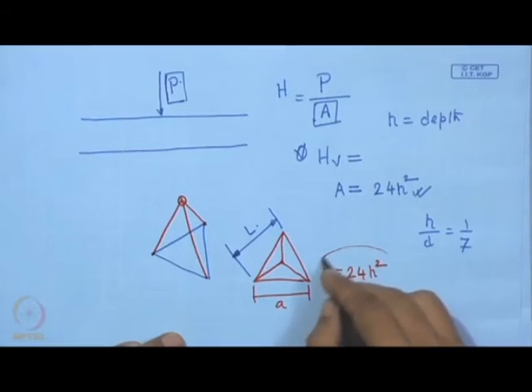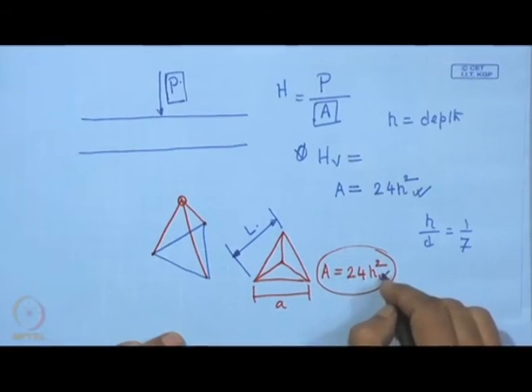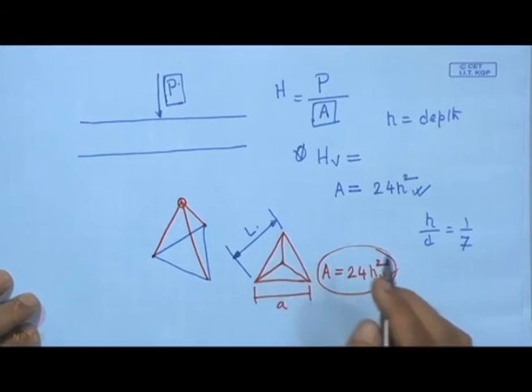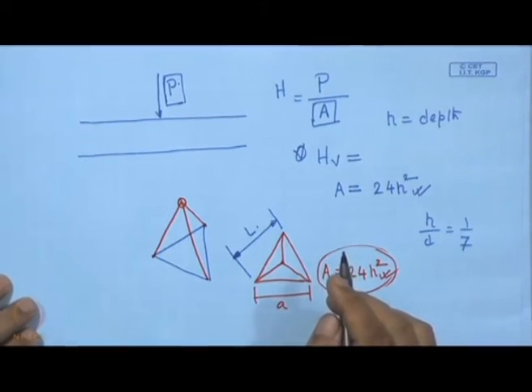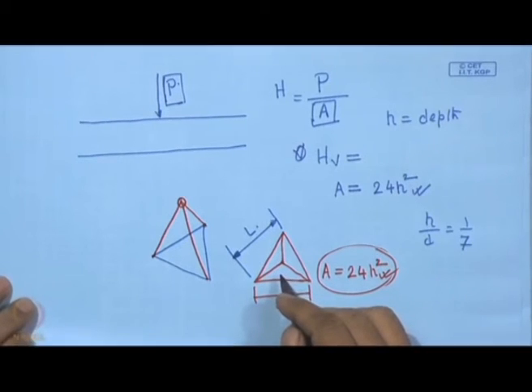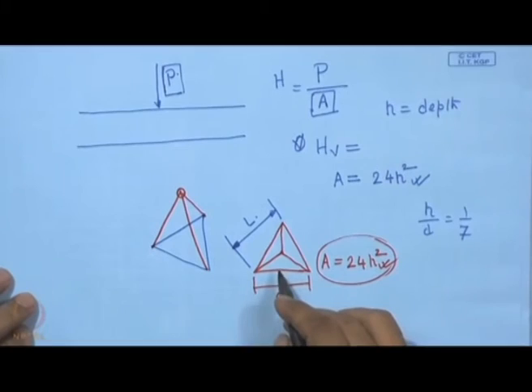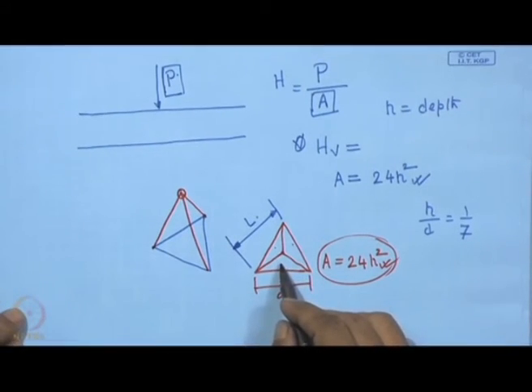So, here it is the penetration depth that is measured, and a triangular pyramid is used for the simple reason that manufacturing is easier and manufacturing precision is better, because these are three non-coplanar planes, and they are anyway going to meet at a point.